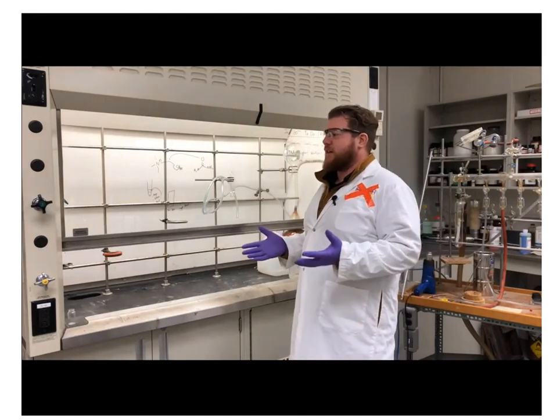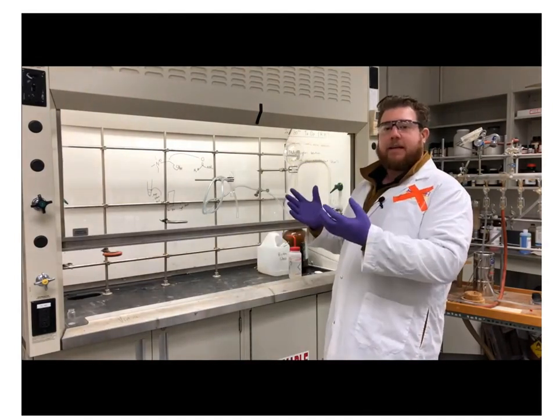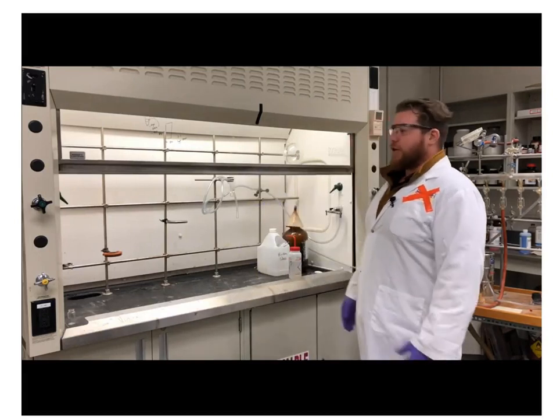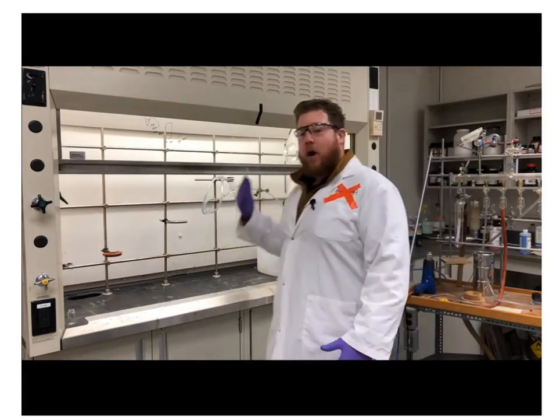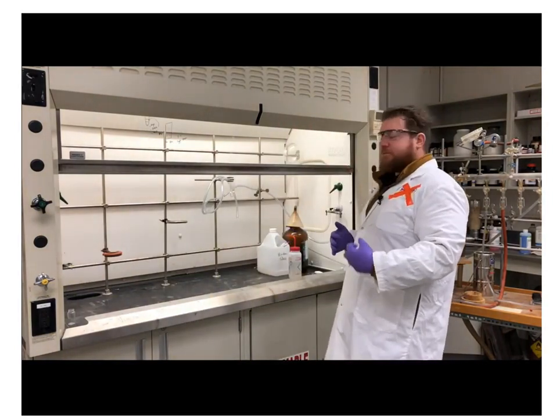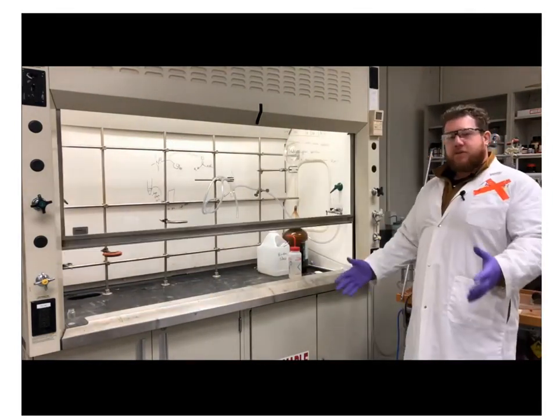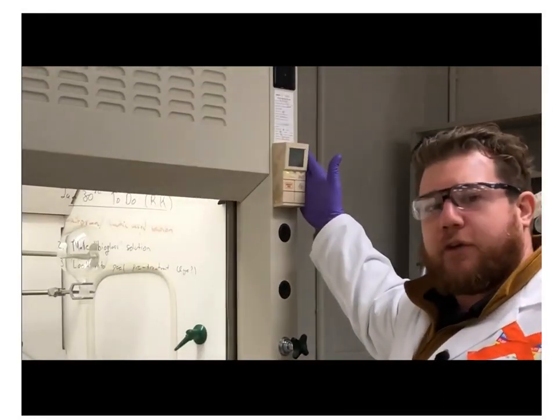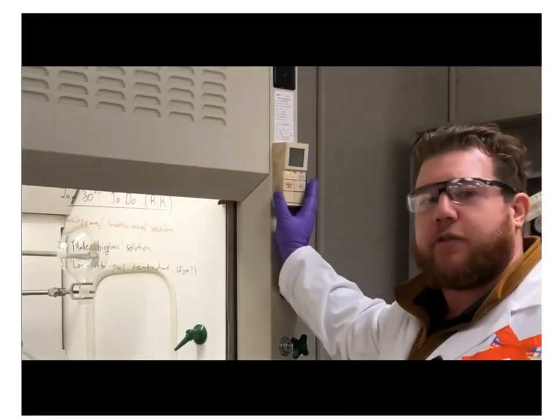Now, this isn't because the air pumps simply lack the capacity to move the air. It's actually because the larger the opening, the greater the capacity somebody simply walking by has to create a low pressure and suck some of the air out. And that's not what you want. So it's very important that whenever you're working with a fume hood, that you check your airflow meter to make sure you have sufficient airflow through.